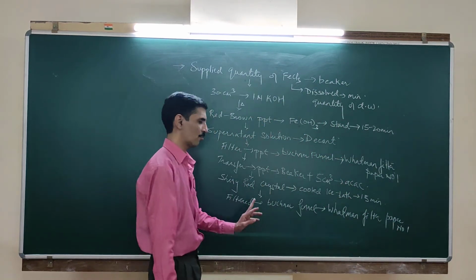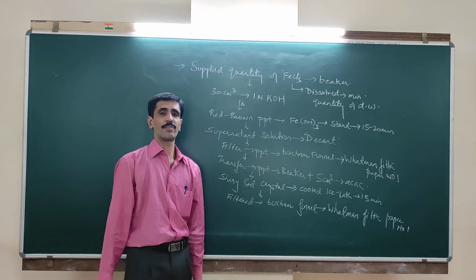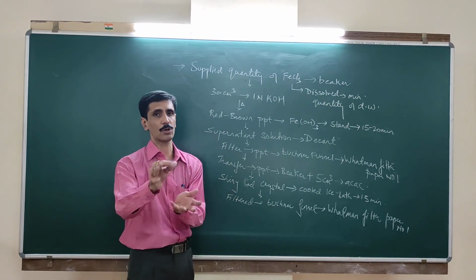Once the filtering is done, we need to carry out the washing also, with distilled water and alcohol.